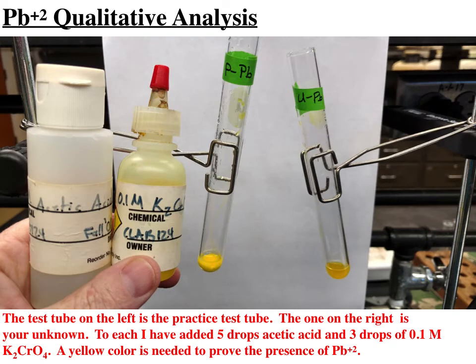So here's what happened to both of my test tubes when I added the two chemicals into each. Now, all I will say to you is that one has a much more vivid color than the other. That's all that is implying, that one might have had more lead in it than the other. But in any event, from the results of this test, you are supposed to be able to determine if there was any lead at all in your unknown. That's what you're supposed to be able to determine if there was a color change.